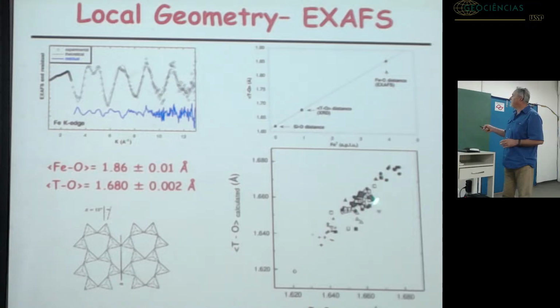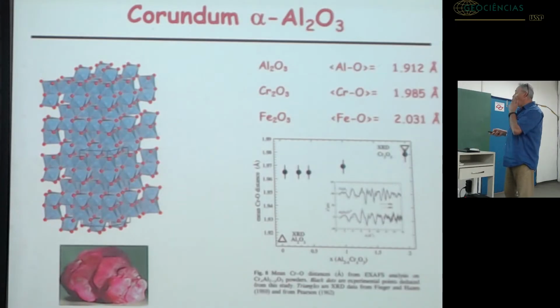And that's a statistical plot for different sets of tetraferric phlogopites with different amounts of iron in the tetrahedron, and actually we see the same results we see from here if we assume that the iron-oxygen distance is the one we determine in one sample. So, in some cases, the structure can locally adapt a lot, even when you insert an atom, which now we call a dopant, in a place where it shouldn't enter because it's too small for it.